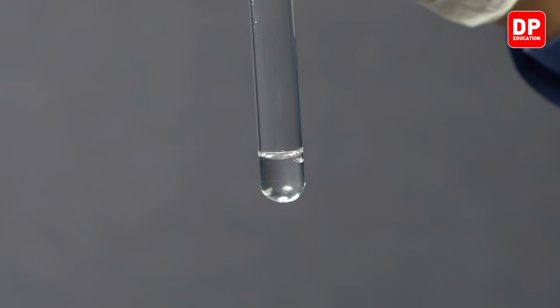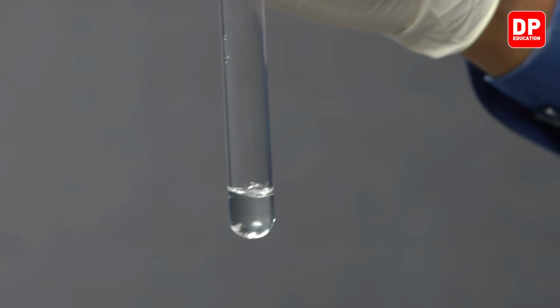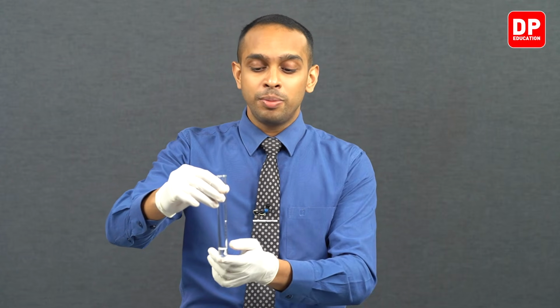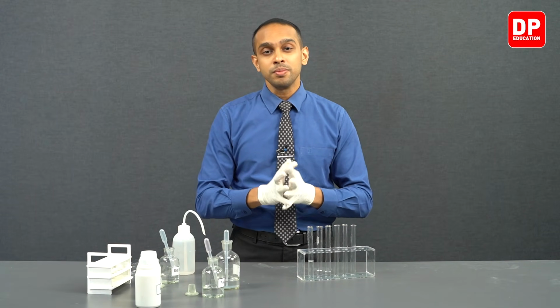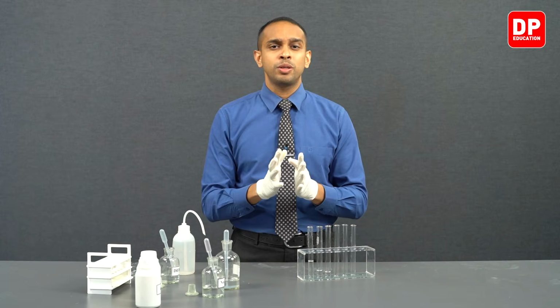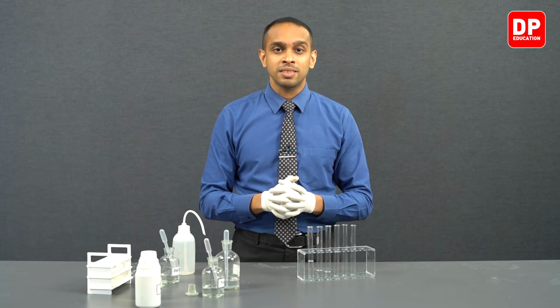Over here, aluminium hydroxide turns into sodium aluminate. Aluminium hydroxide turns into aluminate anion, and along with the sodium ions in the medium, it forms sodium aluminate. So the aluminium hydroxide precipitate that we observed earlier was an amphoteric hydroxide that dissolves in both hydrochloric acid as well as excess sodium hydroxide. So this is a test that can be used to identify the presence of hydroxide ion. This test also can be used to identify the presence of aluminium ions.